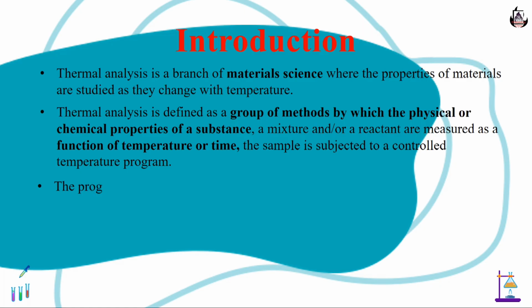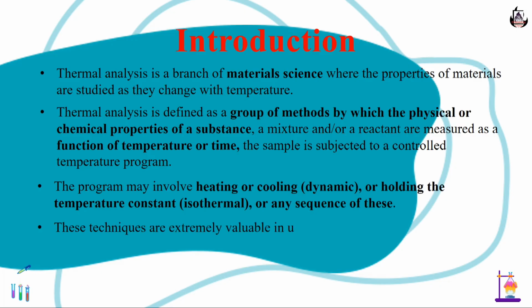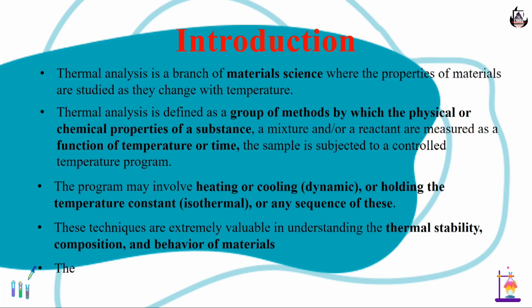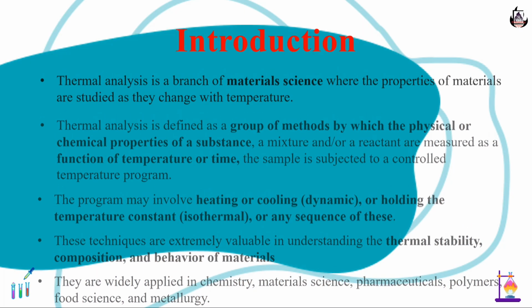The program may involve heating or cooling, that is a dynamic process, or holding the temperature constant, an isothermal process, or any sequences of these. These techniques are extremely valuable in understanding the thermal stability, composition, and behavior of materials. Thermal methods are widely applied in chemistry, material science, pharmaceuticals, polymer industry, food industry, metallurgy, and many more.